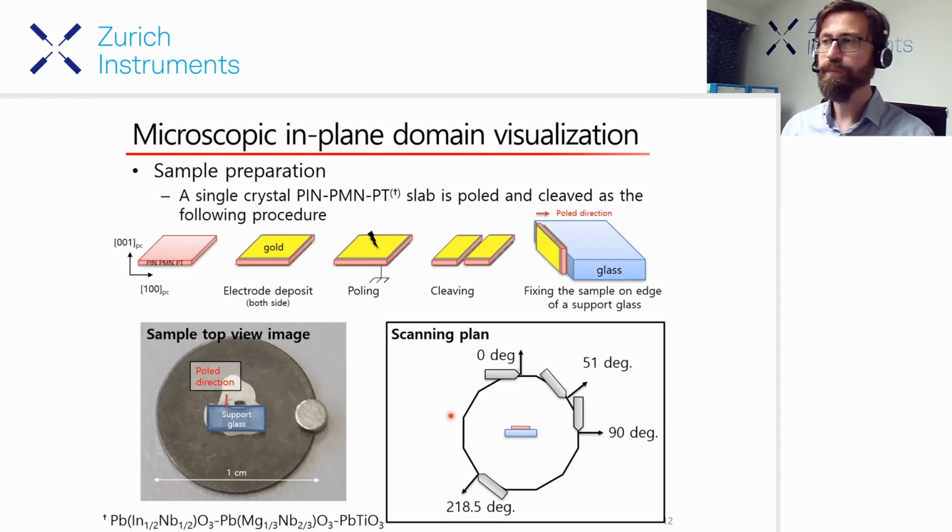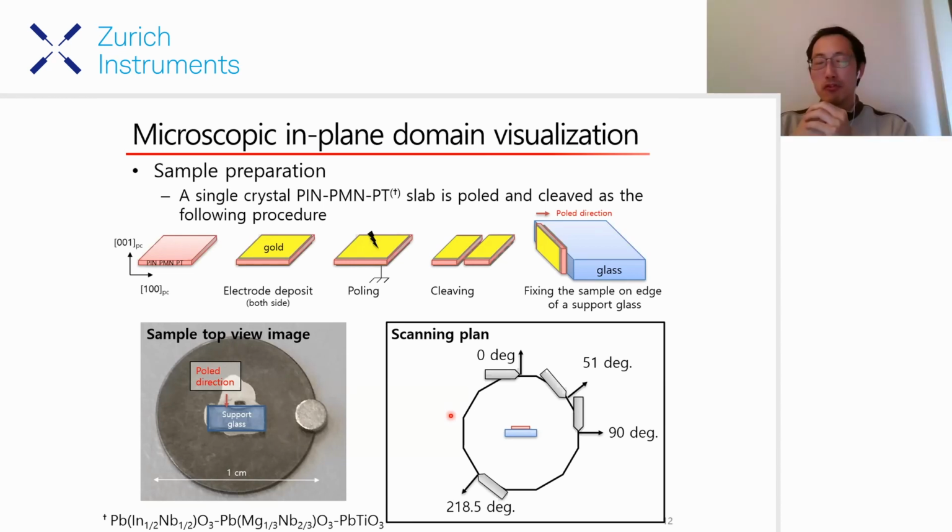Usually we have microscopes, so we can position our cantilever close to the original place, and that will guarantee you are a few micrometers away from the original position, or maybe smaller than that. Then if you start scanning and zoom into the original place, that is the most time-consuming part.